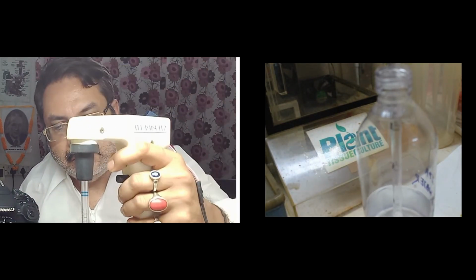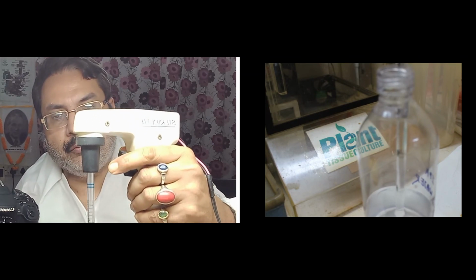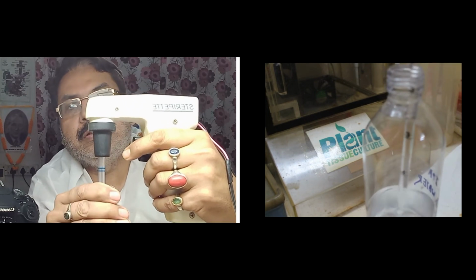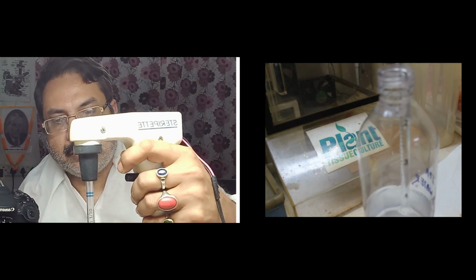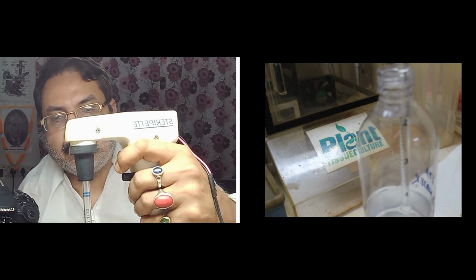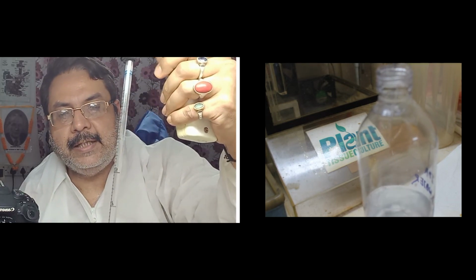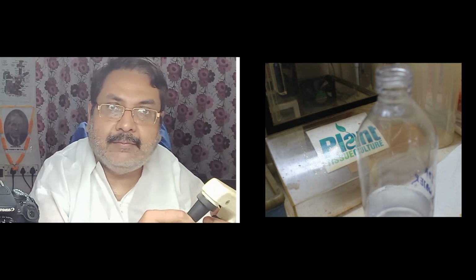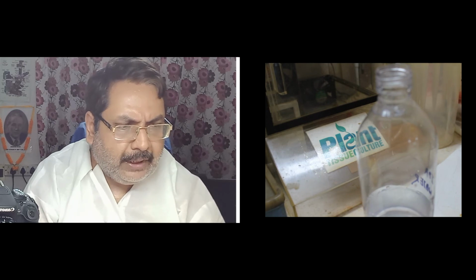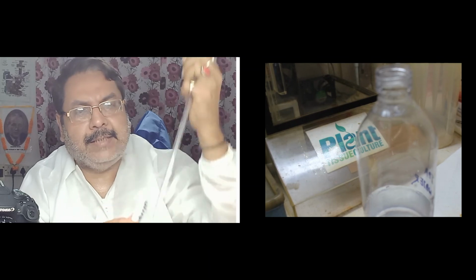So now it is taking up the liquid, and you can get the desired volume. You can just stop when the meniscus of the liquid reaches the mark. You can take up to the 0 mark and stop. It is very easy. There is a release button, and just release and the liquid will go. This is a very useful pipette, but it is a little bit big, so it is difficult to use. Generally this is also used, but auto pipettes are more used than these pipettes.